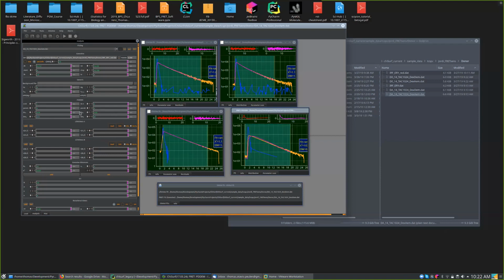If I reverse it and put 0.8 here, you would have the donor channel, because we have the emission of the donor and less emission of the acceptor. These excitation and emission probabilities are 100% determined by your spectra.